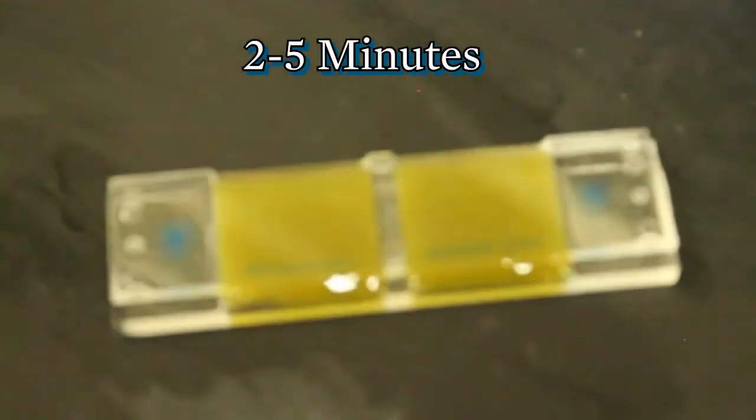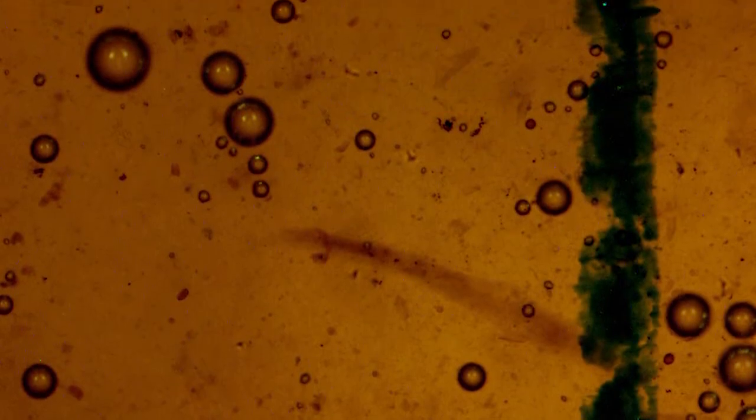We let our slide sit for approximately two to five minutes and it is ready to read under the scope. Once you have placed your slide on a microscope, make sure you're using your 10x objective. Go towards the middle of one of the chambers and find the grid.